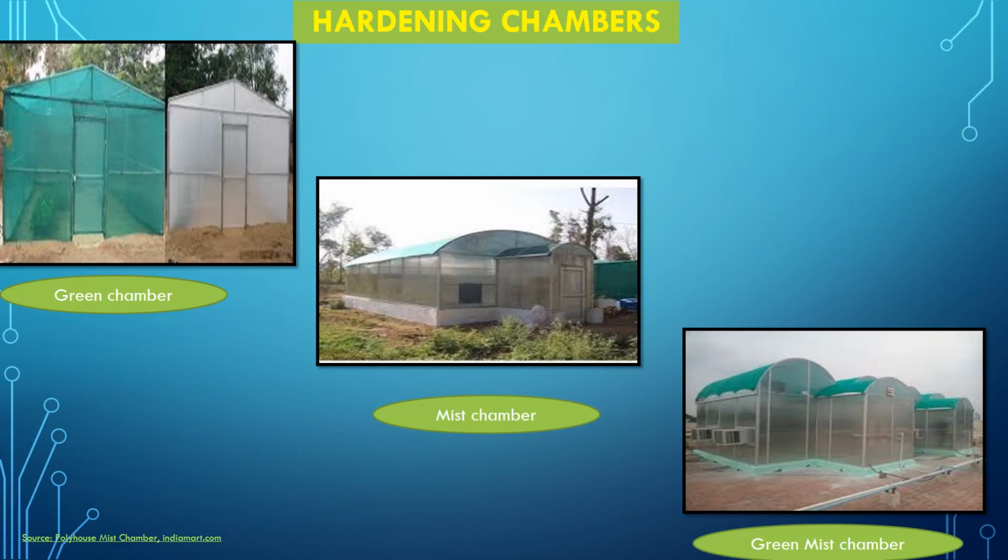After the plantlets are developed in culture, including induction of shoot and root using shoot-root inducing medium conditions, they need to be shifted to field conditions. But having been nurtured and pampered in strictly controlled laboratory conditions, these plantlets will be more vulnerable to environmental shock when moved out of the laboratory. These plantlets are transferred to sterile soil in the plant tissue culture laboratory. They are acclimatized for a few days and then transferred to the chamber.